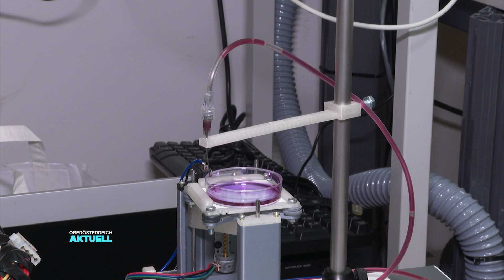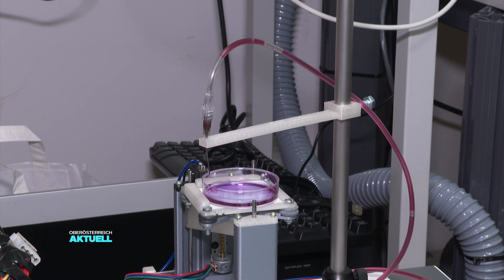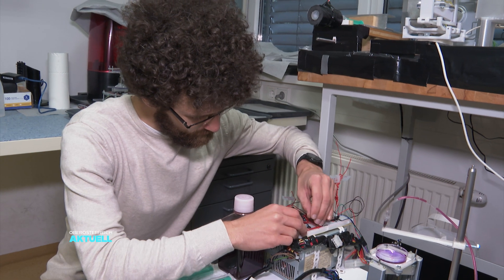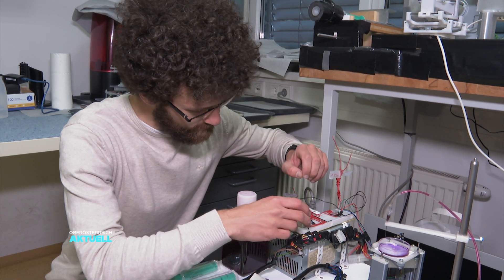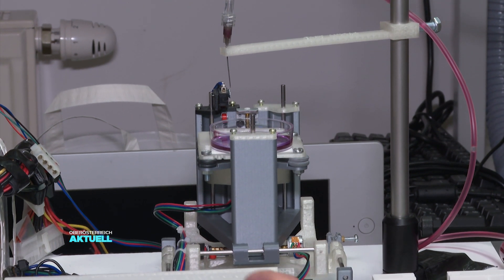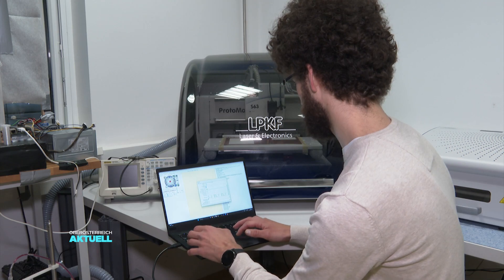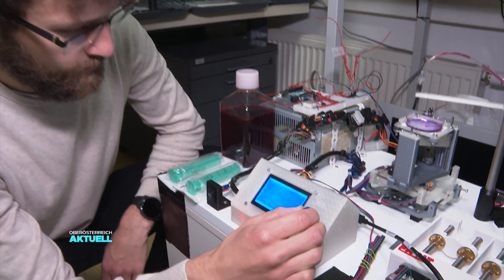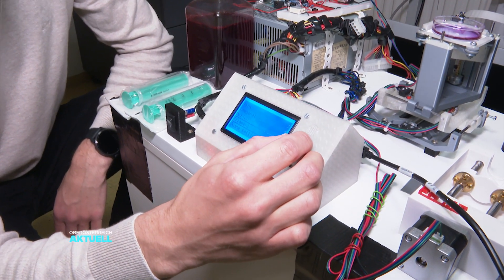At present, this is unable to print organs, but it does operate with cell material. You can use it to print a type of mesh that consists of a gel-like material in which the cells grow. The whole project is open source. We don't wish to be commercially successful; we simply want to make this available to an extensive public. The Linz researchers have put the blueprint for their bio-printer online, and while other models cost several hundred thousand euros, this one costs 300.